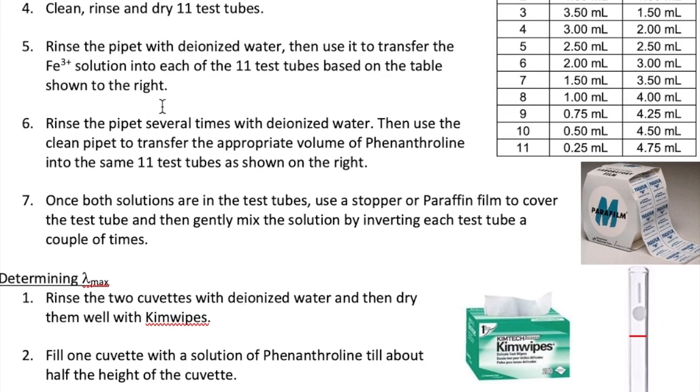Once you have the pipette, rinse it with water by pipetting deionized water and then discarding it into the sink. Do this twice. Pipette the correct volume of Iron solution into each of the tubes as given in the table in your lab procedure, which is also shown here. When you're done with all 11 test tubes, rinse the inside of your pipette with deionized water three times. Then use the pipette to transfer the correct volume of Phenanthroline into the 11 test tubes, which is also shown here and in your lab procedure.